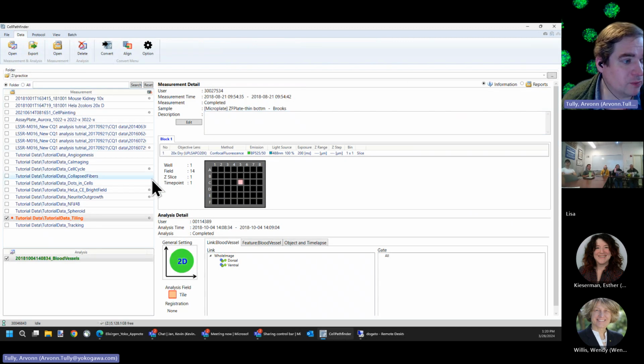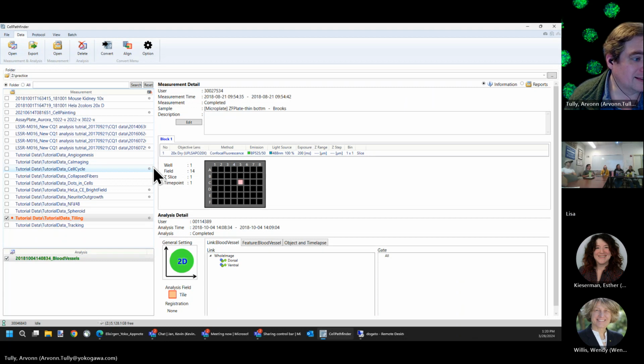So again, what can everyone tell me? What's the most important thing? Who's the person with the MacBook and the NASA thing? Yeah, you. Do you remember what's the most important thing? Trust the parent, not the child. Yes, good. Okay, that's 50%. Now, what's the second most important thing? I don't know. Find a little brightness contrast. Yeah, brightness. I just had to leave the room.